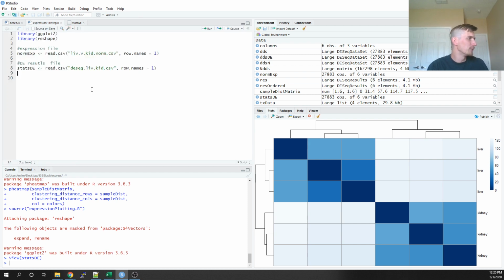So I'm going to get rid of these NAs. R allows me to remove NAs pretty easily. What I'm going to do is call this command called na.omit. It means that if any cell in any column has an NA in it, get rid of that entire row. So I'm going to do that, and that's going to get rid of all of my NAs.